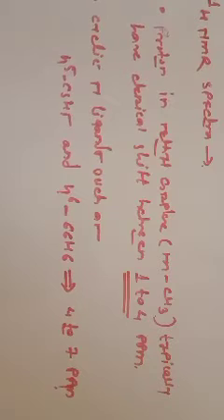Whenever the proton is directly bonded to the metal, its value is -5 to -20 ppm. Then the methyl protons have a value of 1 to 4 ppm. Whenever we consider a cyclic pi ligand such as eta 5 C5H5 and eta 6 C6H6, its value lies between 4 to 7 ppm. So these are some common ligands and their chemical shift values.